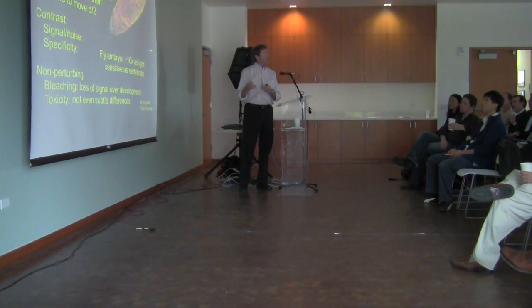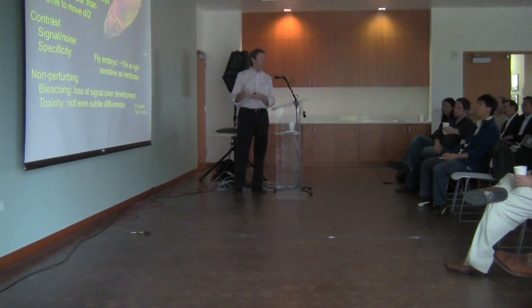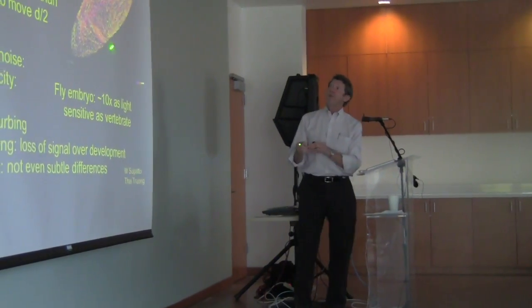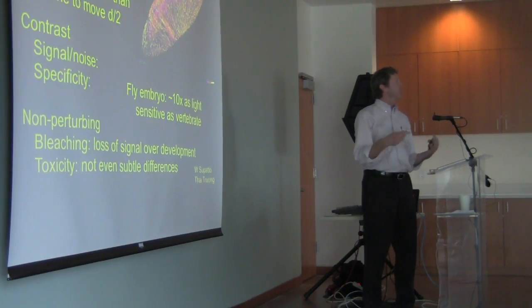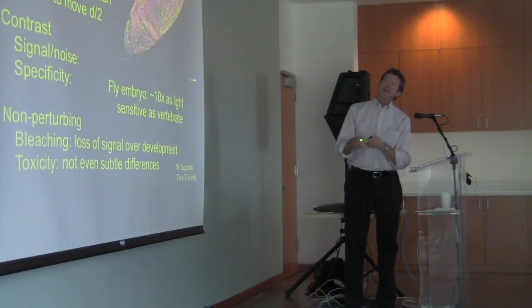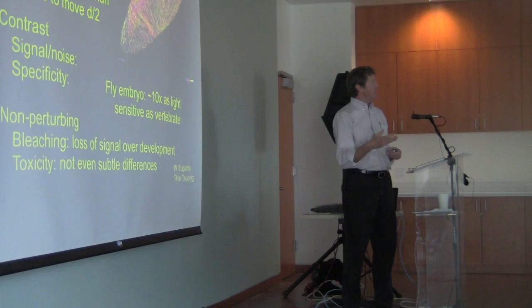When we think about what we need for this sort of compromise between resolution and contrast and such, what we want to be able to do is put down the life history of every one of the cells. And this is showing you the end of the trajectory of all the development, all the motions, all the lineages and all that went into building this embryo. So we need to be able to follow those cells often enough that we don't get confused.